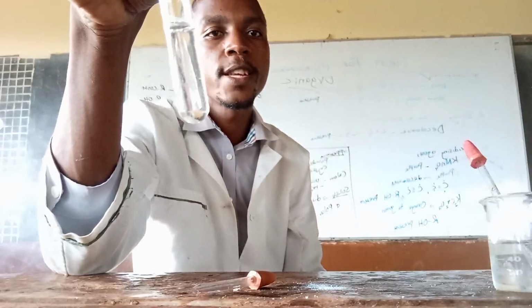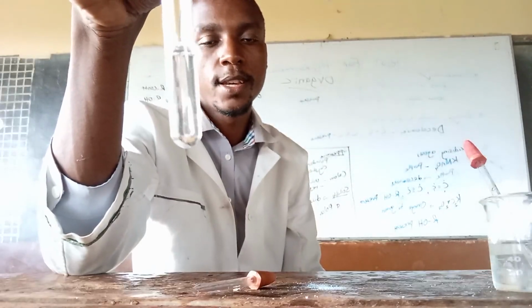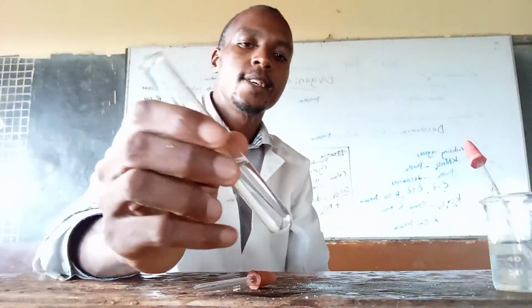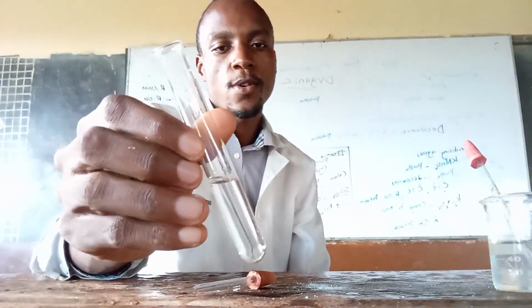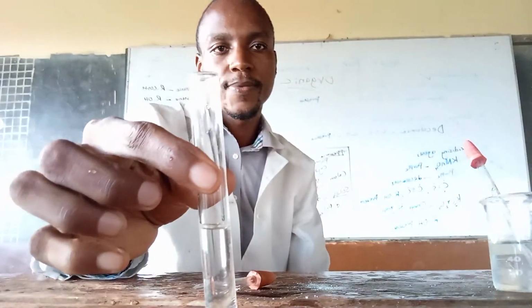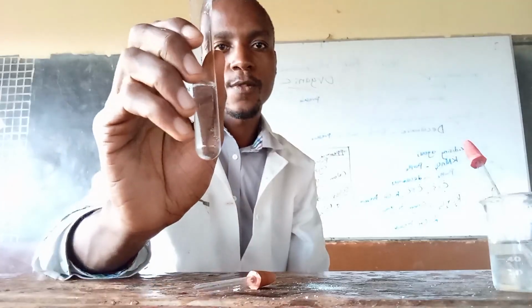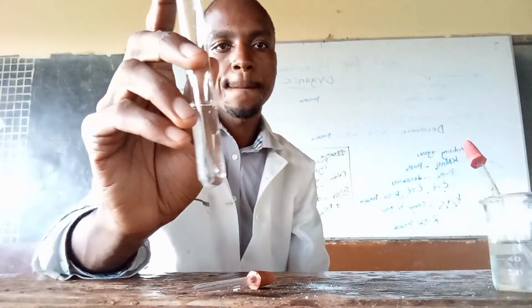It is only the 3 sisters or the ZAP that behave that way. So the inference is zinc ions, aluminium ions, or lead ions present. That way, we have ruled out the presence of calcium or magnesium ions.